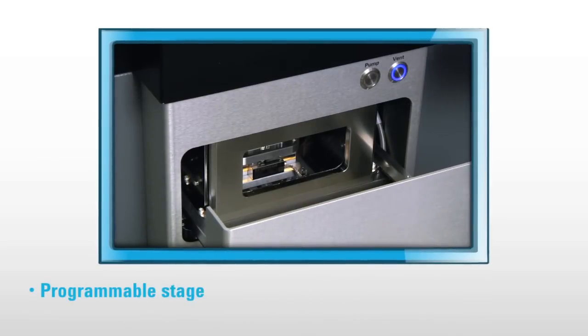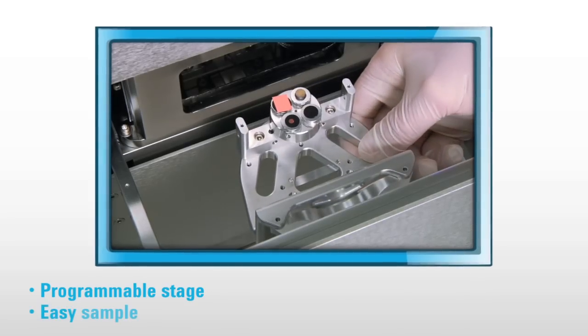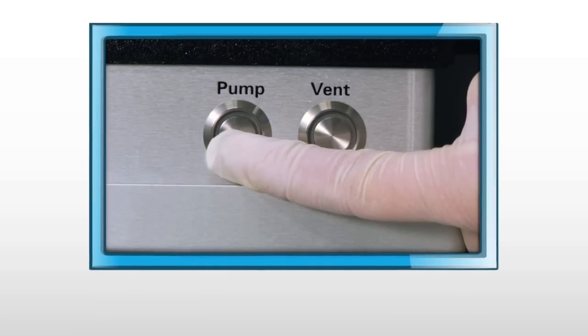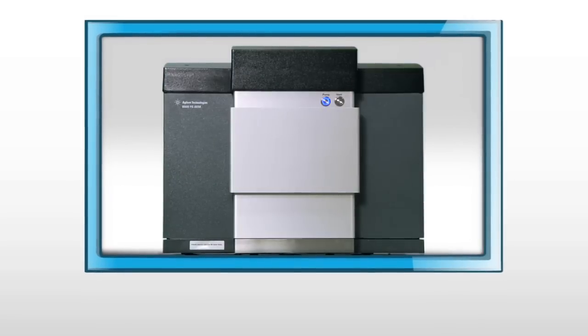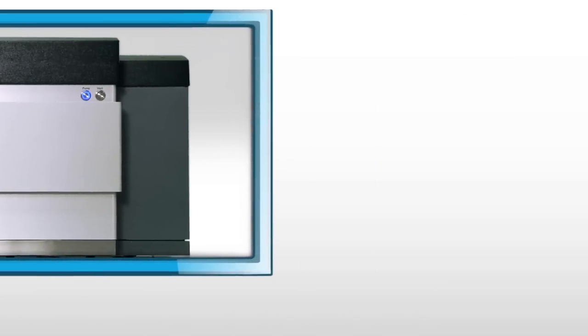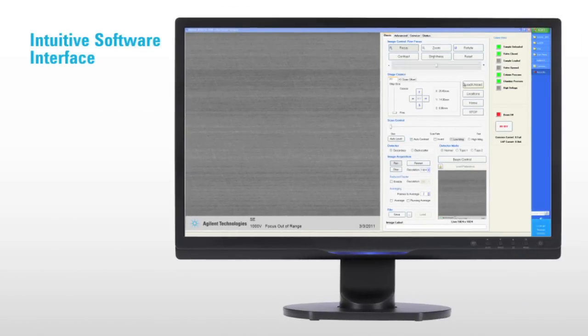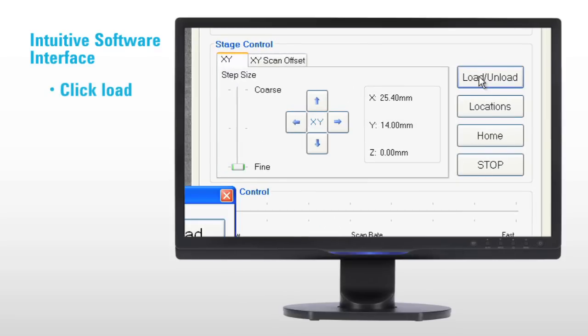The programmable stage allows you to easily find regions of interest on the sample or move between samples if multiple samples are loaded into the instrument. It allows you to set and store precise coordinates for areas of interest.